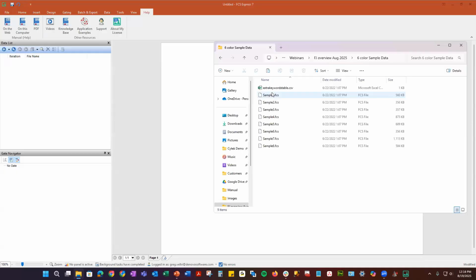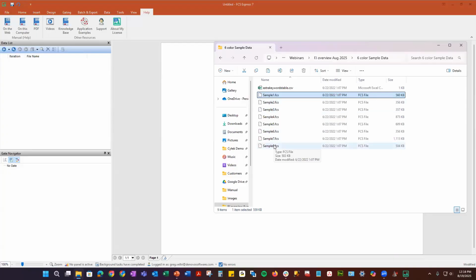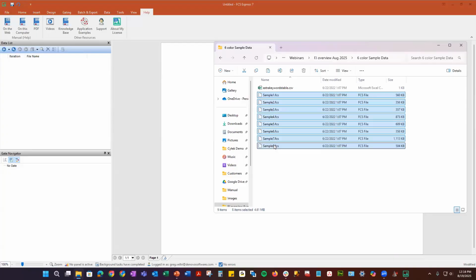What I have here is 8 samples, excuse me. Now we could bring them in a couple of ways. Please don't raise your hand, just write in the questions and answers, and then I'll be able to answer your question, or Sean will be able to answer your question for you, okay?